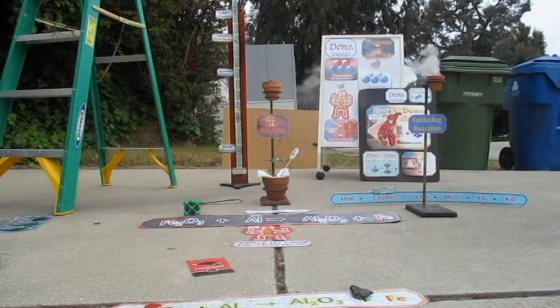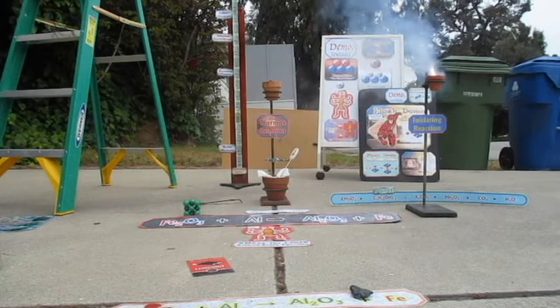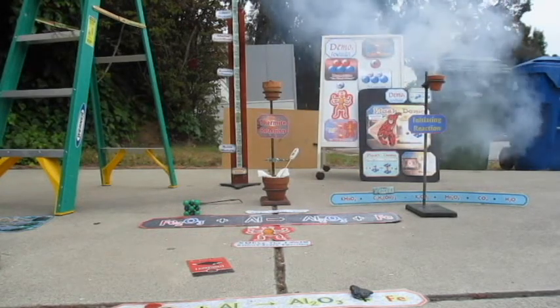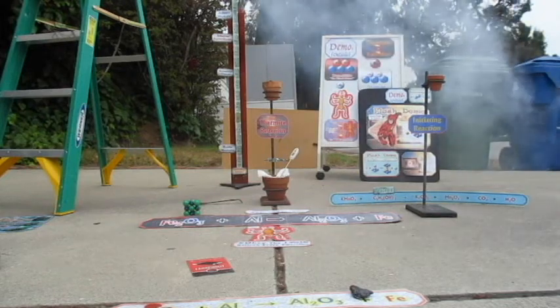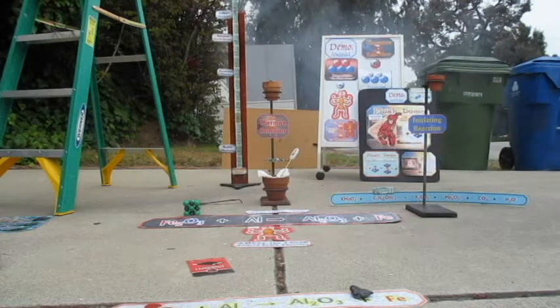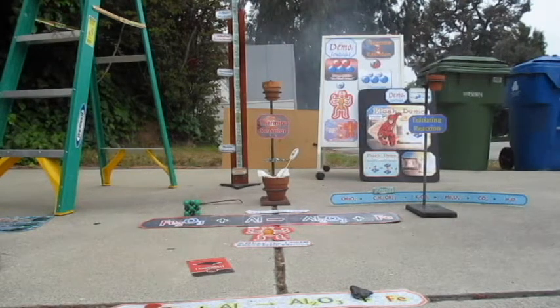Quiet. There it goes. There's the initiating reaction. So now notice it's smoldering, but it really didn't do all that much. That's kind of what I expected. So that wasn't enough to start the thermite. But the great thing about seeing that reaction is that you can now try to balance it. You can try to balance this crazy one now that you've seen it. That was glycerin reacting with potassium permanganate.